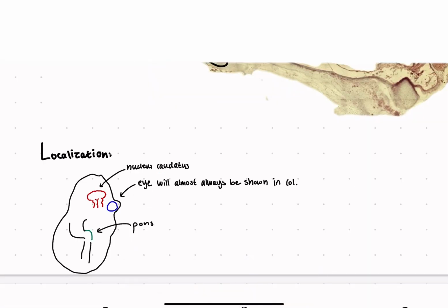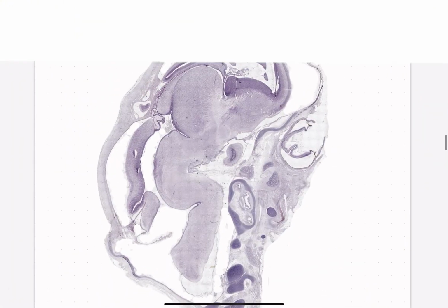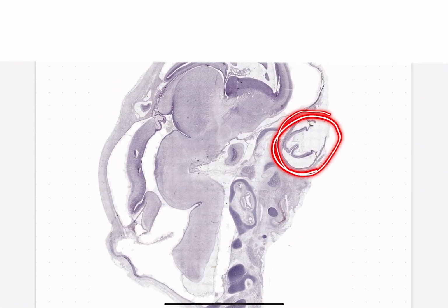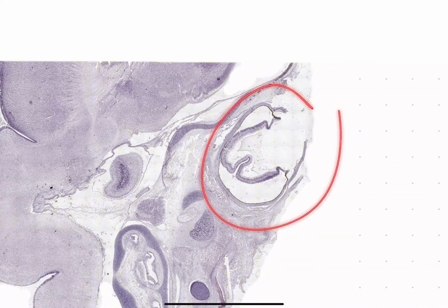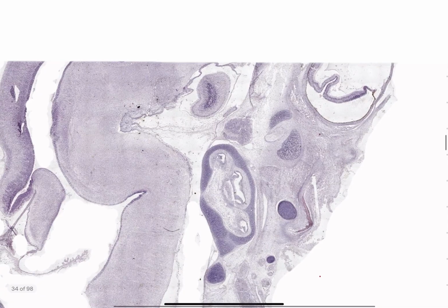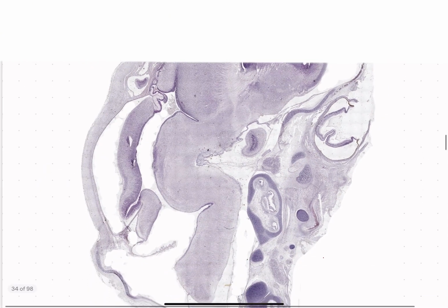If we look back at the images, there we go. This is another one. So here we can't see the eye super perfectly. Well, we're actually missing the lens, but hopefully that still makes sense that this would be the eye area. Then towards the bottom left of the eye, like I said, it could be upside down. We'll get to it soon.